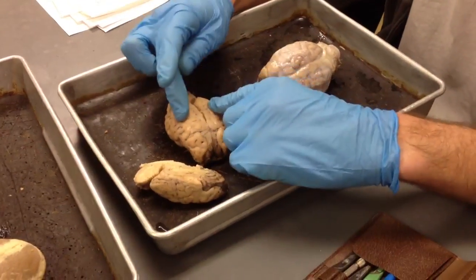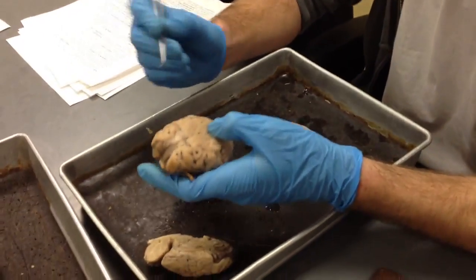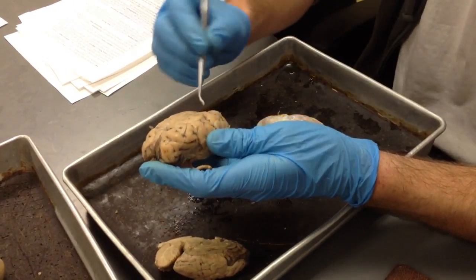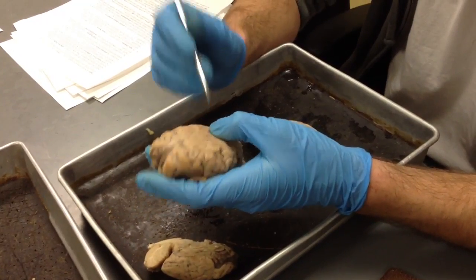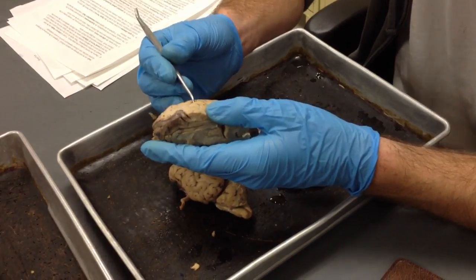which makes up our two cerebral hemispheres and the dura mater. The pia mater is one of them, and that is going to directly line our gyrus, each of these protrusions, and follow them down into the sulci. So the pia mater is going to be directly on top of these and follow them down into the crevices.